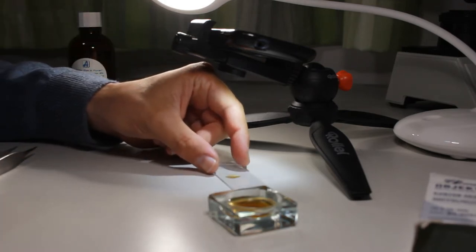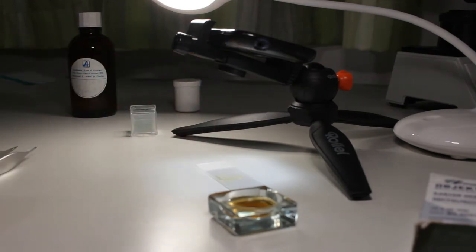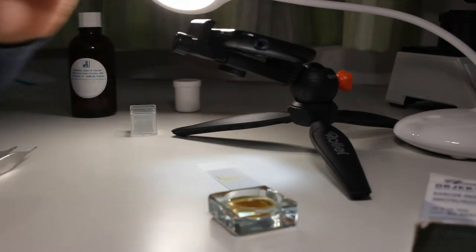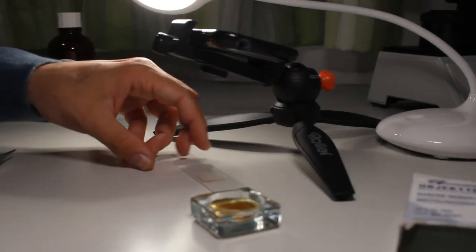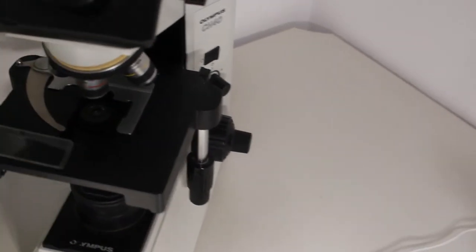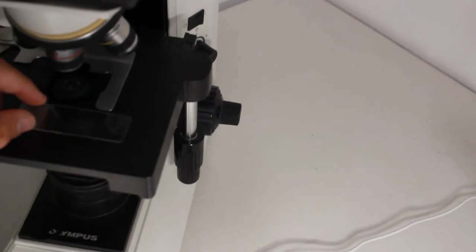Okay, I think I only have one cover glass now. Yeah, and then I simply place it on top here. Yeah, and that's it. I stop recording, and then of course everything goes into the microscope. I'm simply going to pick up the camera again. Okay, so then we turn on the screen, and it goes directly into the camera. It's a little difficult for me now because I have to hold the camera at the same time. I have to put it in here.